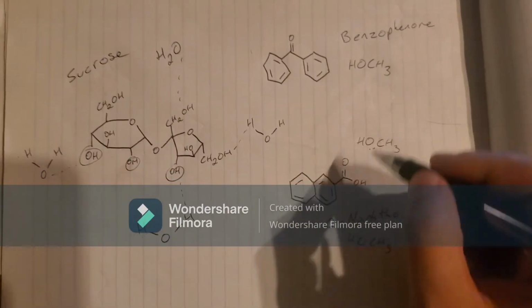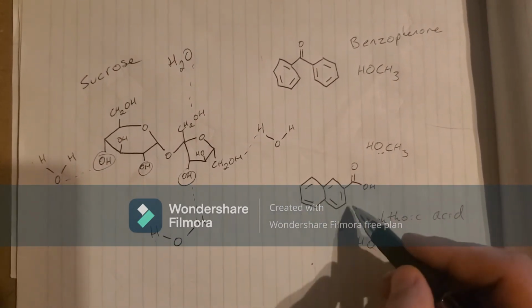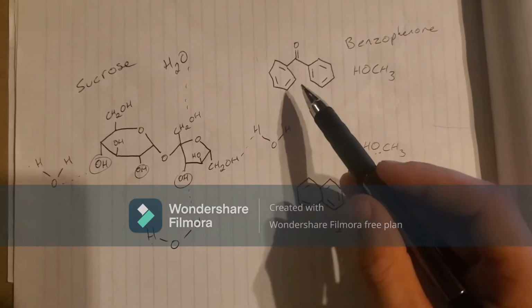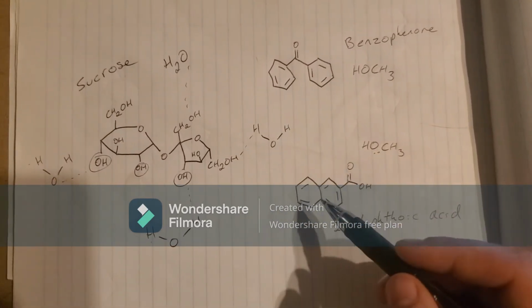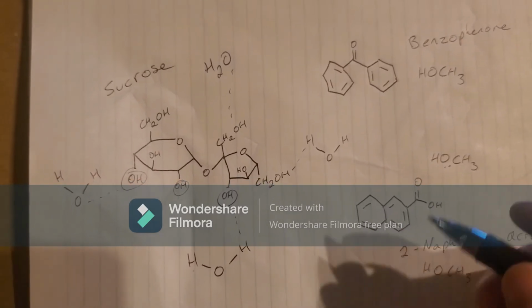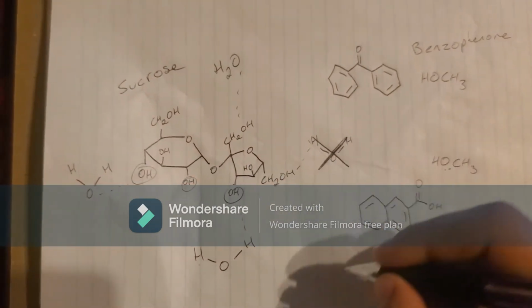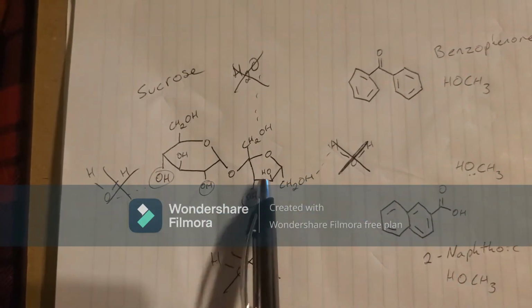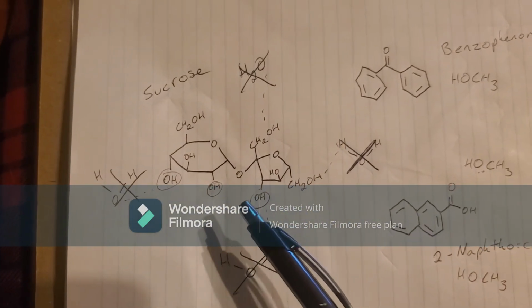And then we use methanol to separate these two, as this is a bigger dipole, and so methanol can solvate this much easier than this. So once this is dissolved, then we simply just have to filter out the benzophenone because it will not be dissolved by the cold methanol. The recrystallization part of it works because once all of these are evaporated off and eliminated, there's no longer anything holding it into solution. Once there's no more water, we'll just have pure sugar left over.